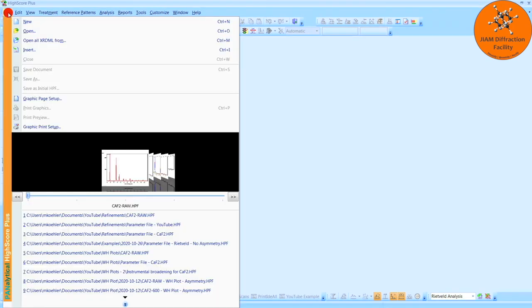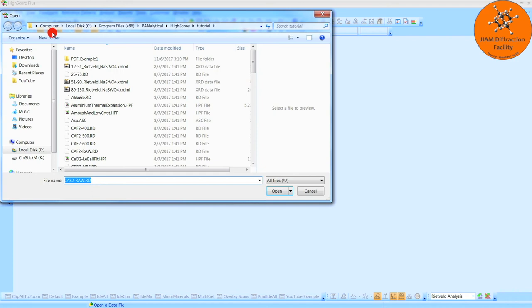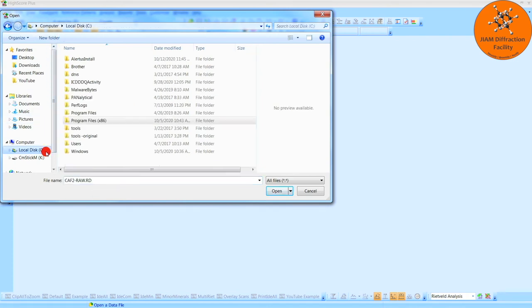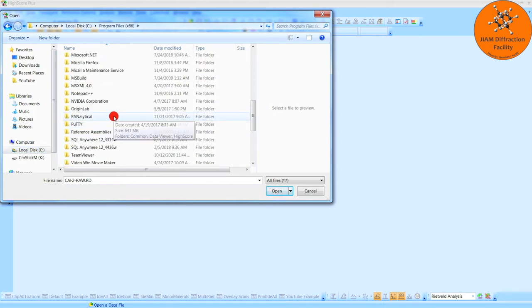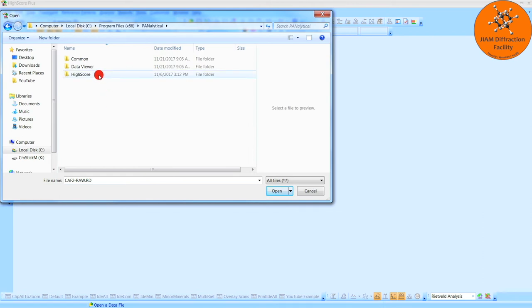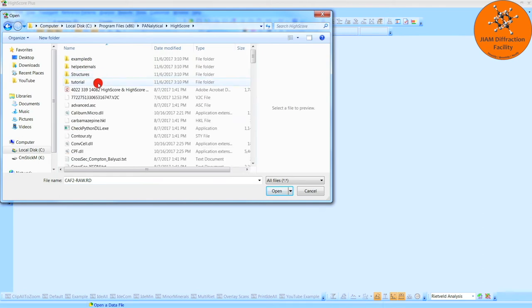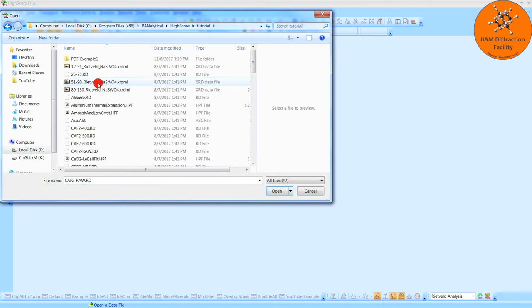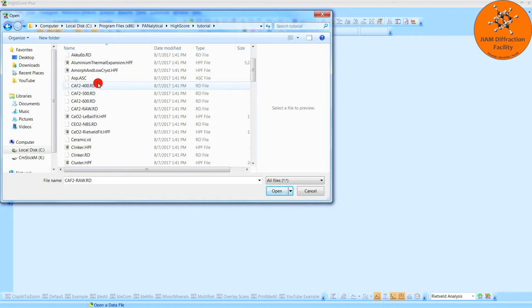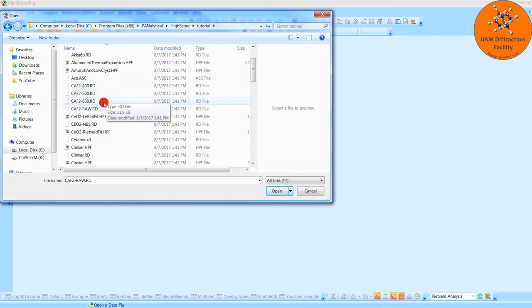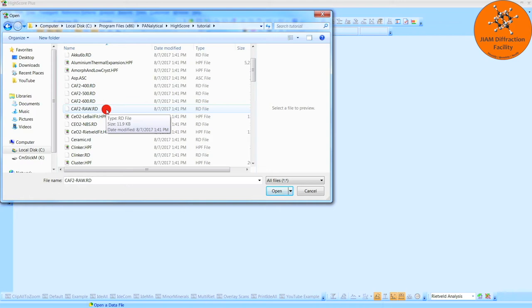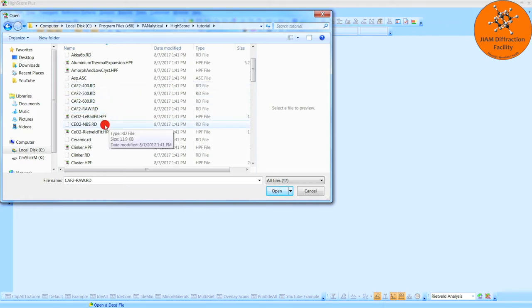Let's click File, Open. If you go to Local Disk C, Program Files x86, Panalytical, Highscore, and Tutorial, you will see a whole list of files used in the example problems presented in Highscore's help file. For this series of videos, we will be looking at these fluorite samples. This one is just raw. These have been heat treated at 4, 5, and 600 degrees. I will only be analyzing the raw file, but you can analyze the others if you like. And then the cerium oxide here is what we will use to determine the instrumental broadening. Let's begin with this file and double click.